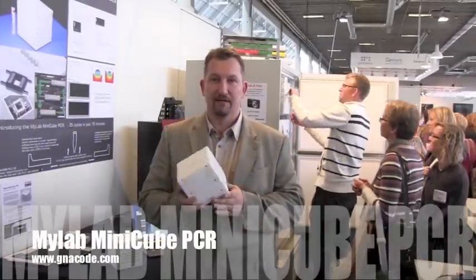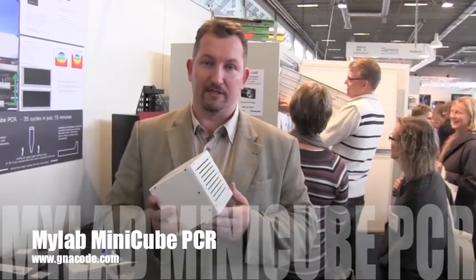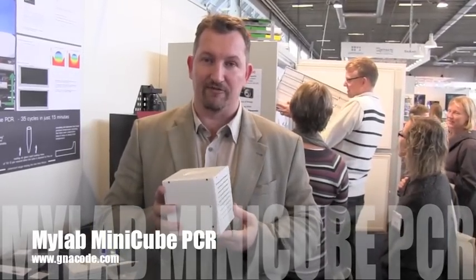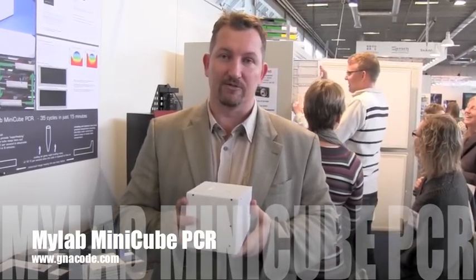We are presenting this device. It's a PCR machine, but it's a very rapid PCR machine. It can do 35 cycles in 15 minutes, compared to normal PCR machines, which take 45 minutes to 1 hour.